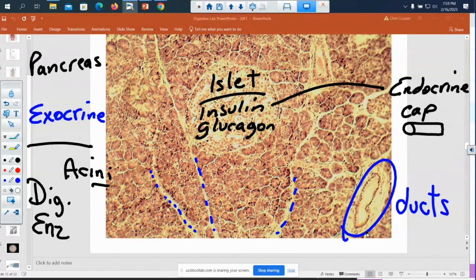If you want to get that, you may. The acini is like the little. Yeah. So they will go to that duct. Yes, so then watch, it would go. It would work its way through on the outside, the backside of all those. Yeah, it's kind of neat.